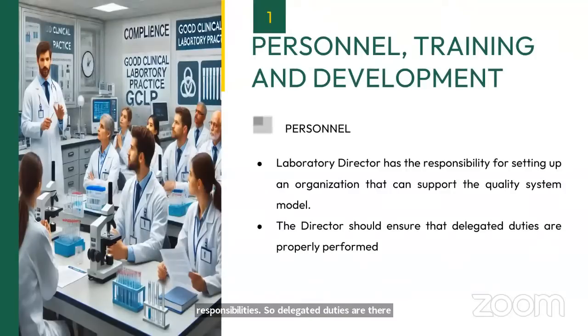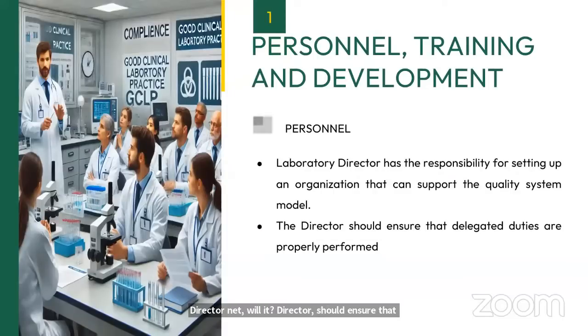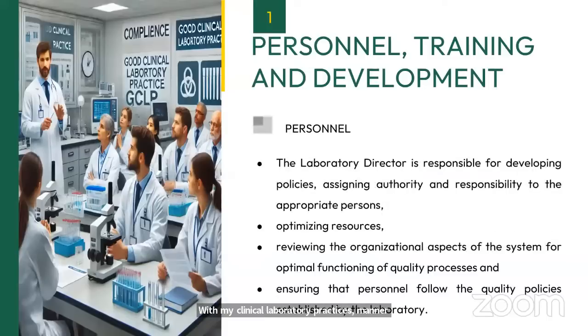It is the responsibility of the laboratory director to ensure that whatever duties have been allocated or delegated to these supervisors in the phlebotomy area, they perform them appropriately and in a good clinical laboratory practices manner. The laboratory director is responsible for developing policies and assigning authorities and responsibilities to the appropriate personnel.